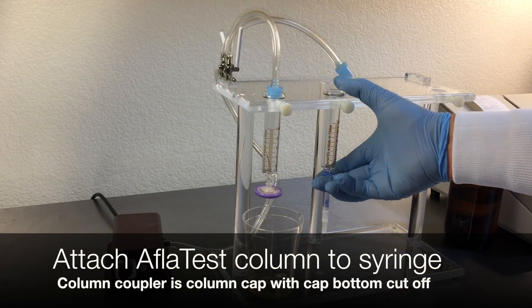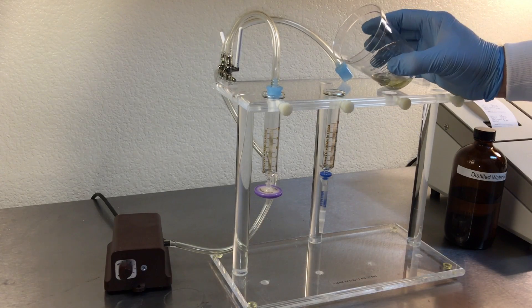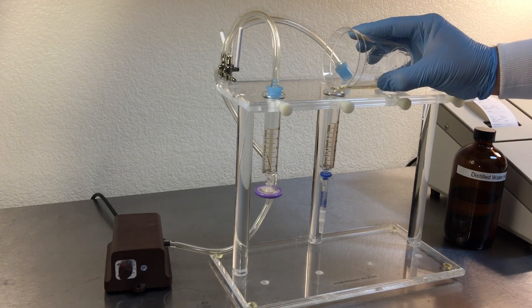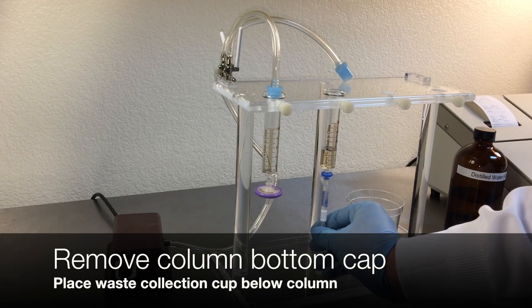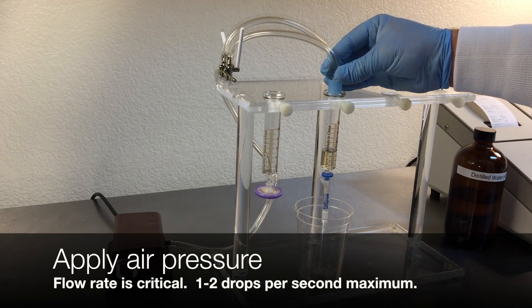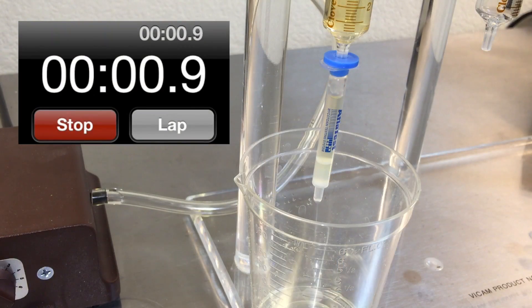Attach the air pump and push the extract through the filter, collecting into a new clean vessel. Attach an Aflatest column to the bottom of the syringe — the column coupler is just the column cap with the bottom cut off. Pass 4 milliliters of filtered diluted extract completely through the Aflatest column at a rate of about one drop per second until air passes through. Column flow rate is critical; you want a maximum of one to two drops per second. Hold the cap for the air pump against the top of the syringe barrel to adjust the flow rate properly — you may have to do this manually.